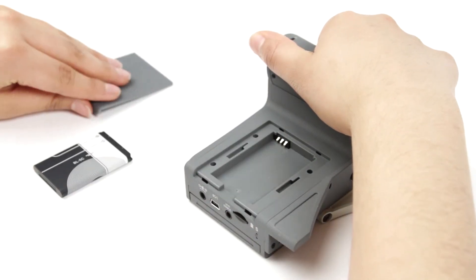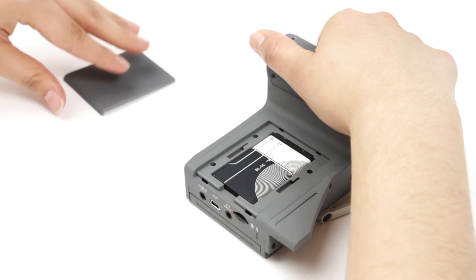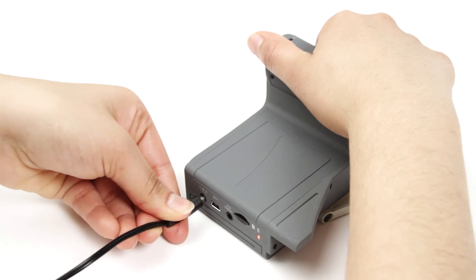FlipView's internal rechargeable lithium-ion battery provides up to three hours of worry-free use, making this microscope perfect for taking into the field for explorations of the natural world.